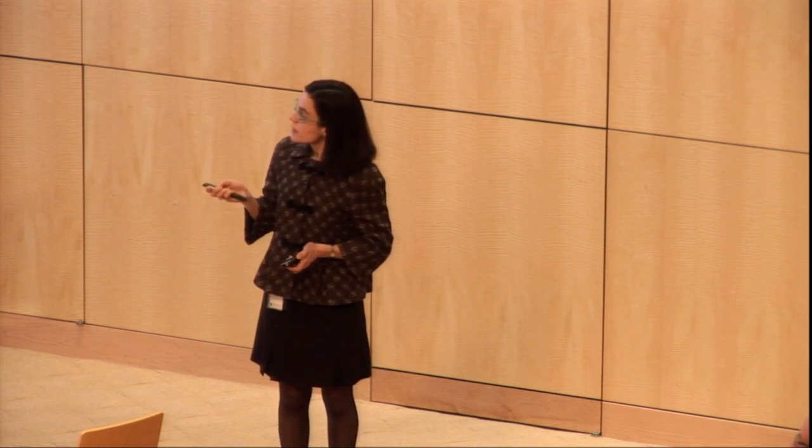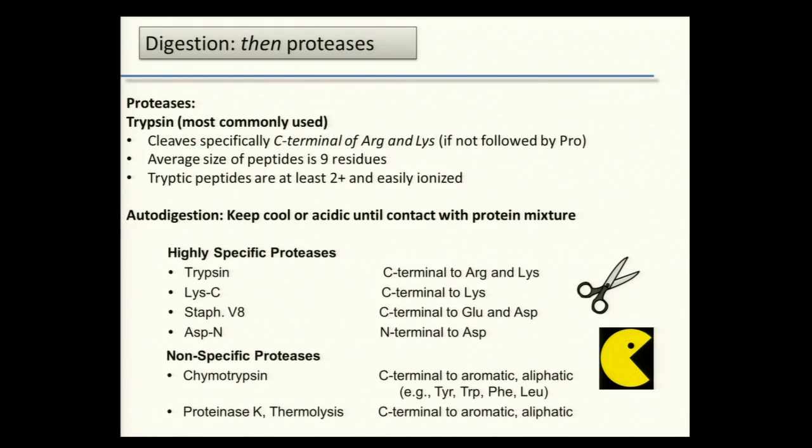Another reason is that you might be looking for, in a particular protein, a specific post-translational modification that you have an idea of where it could be. And trypsin might not cut or give you the peptides of the length or the desired coverage to find that post-translational modification. So in general, we use trypsin, but depending on what you're doing, you might want to start getting crafty and thinking about which ones you want to combine or what you want to use, or using a combination of these.